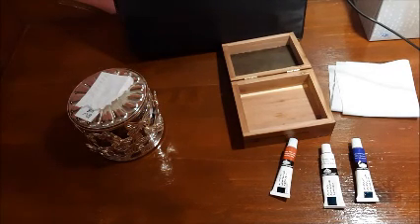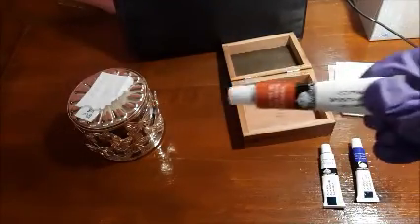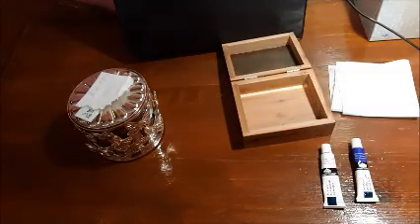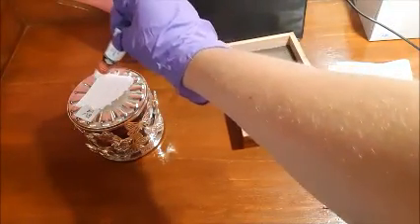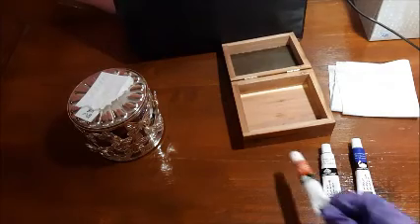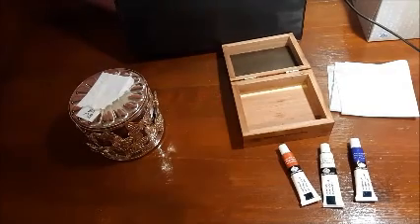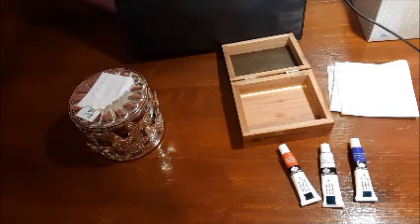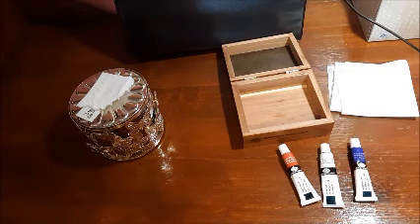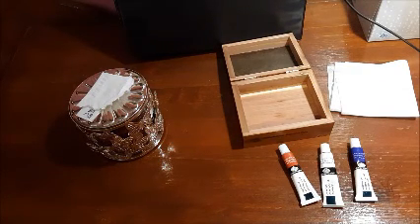Once the heat fix slide is on the slide rack over the steam bath, I'm going to apply my first stain, which is carbol fuchsin. You'd want to saturate the bibulous paper with it. Once you've applied the carbol fuchsin stain, let the heat fix slide sit over the steam bath for about 10 minutes. The reason you need to steam the heat fix slide with the bibulous paper and carbol fuchsin stain is that the steam will drive the stain into the acid-fast cells.